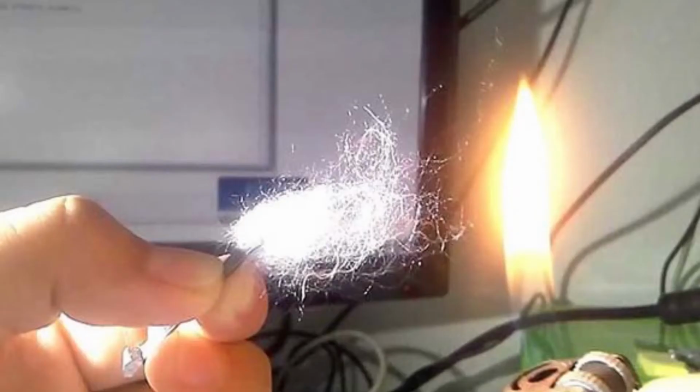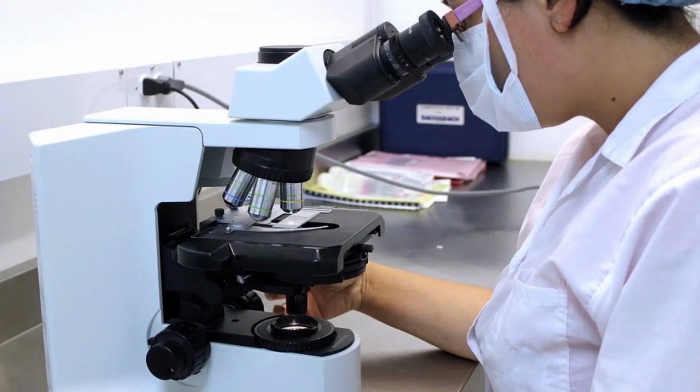Burning test: by placing the fabric near the edge of the flame, observe the smell of the burnt fiber and record the odor of the fabric. Next, flame test: by placing the fabric over the flame, identify the nature of the burnt end of the sample and record the observation. The next test is the microscopic test. This test is to observe the appearance and structure of the fiber sample under the microscope to identify natural or synthetic fiber.